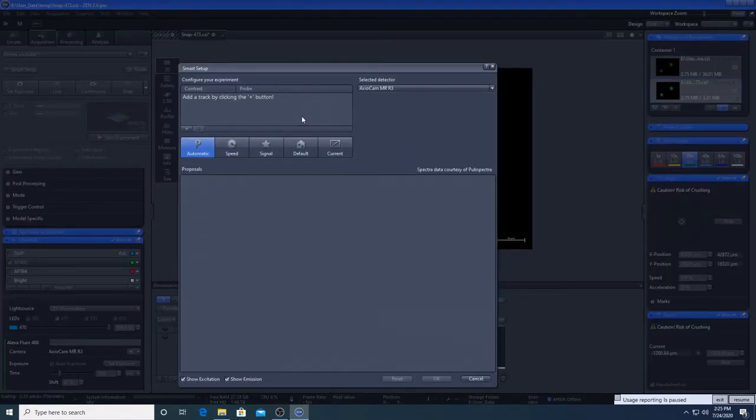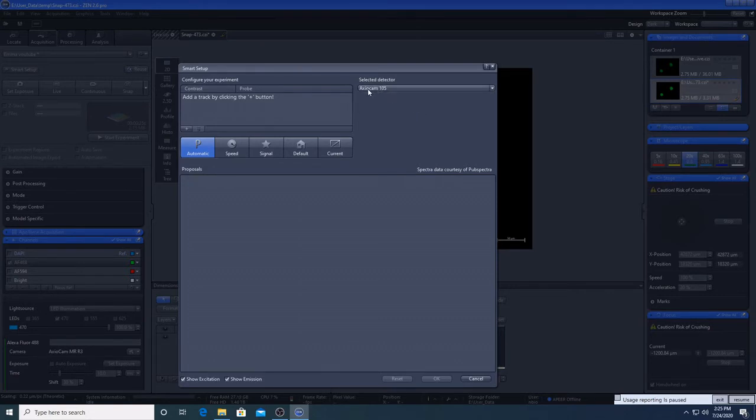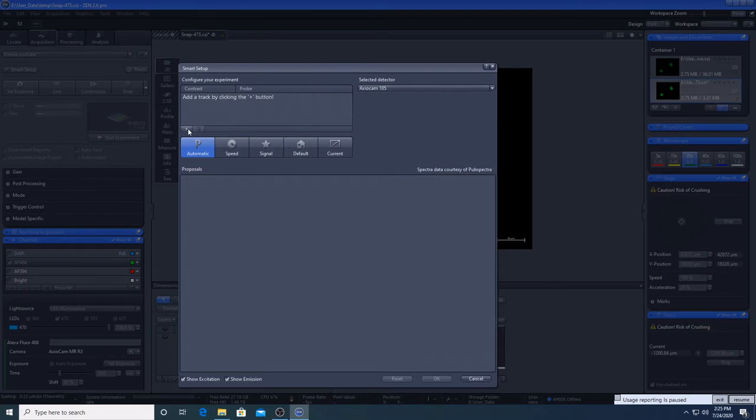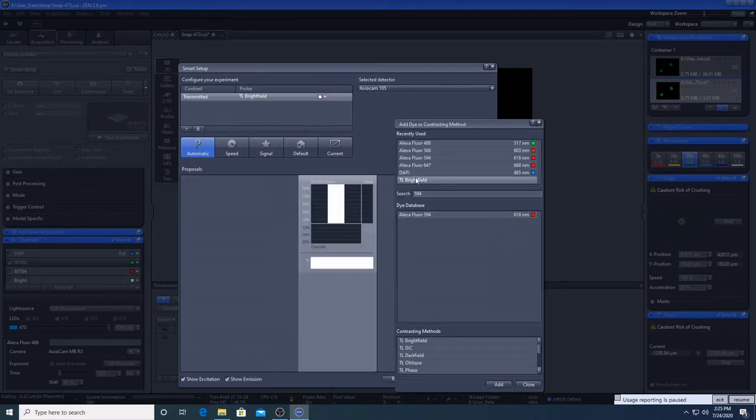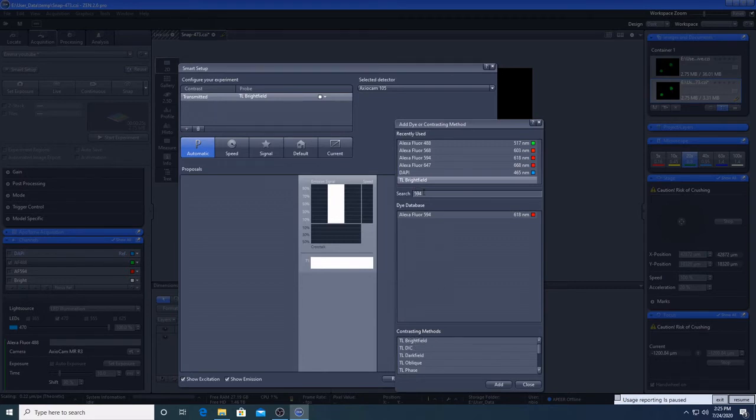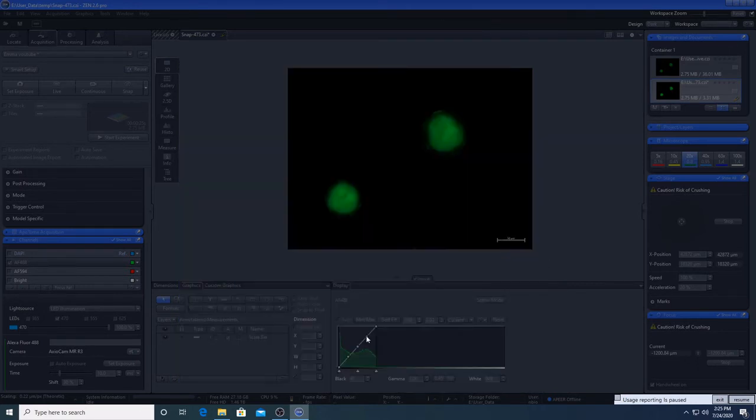I'm now going to cover taking an image with transmitted light and the color camera. So we'll select the color camera there, Axiocam 105, and we're going to add a bright field channel. That's already there, so you can double click it from there. Or as I said before, you can just search for anything. So we close, and we go OK.